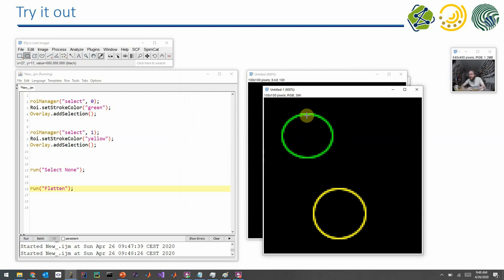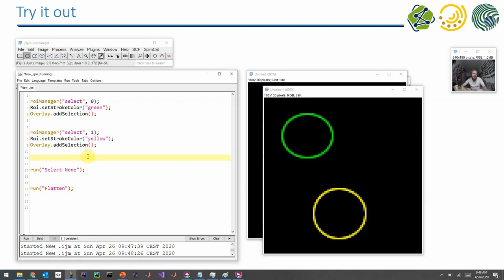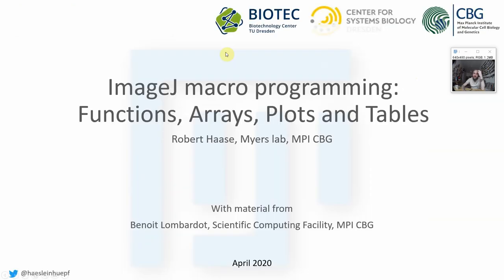And this is an image you could save to disk, and you can open in PowerPoint or in any other program where the outlines are actually visible. This is kind of important if you want to visualize some different things in different colors.